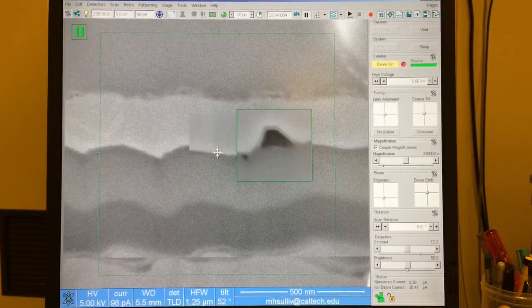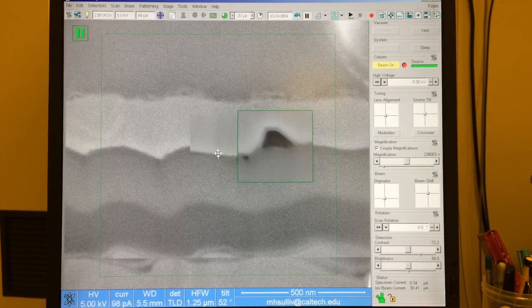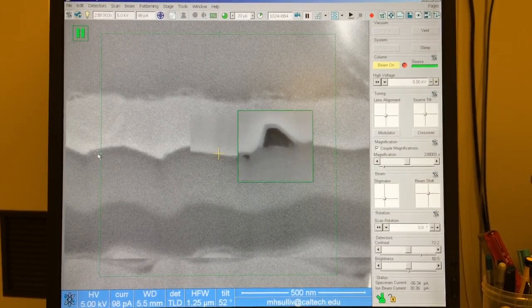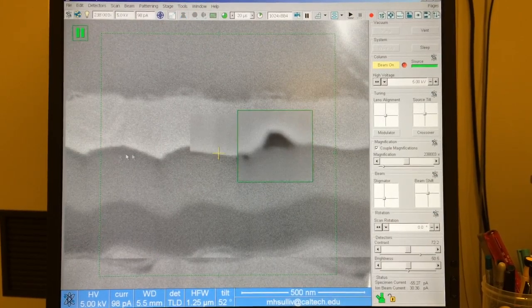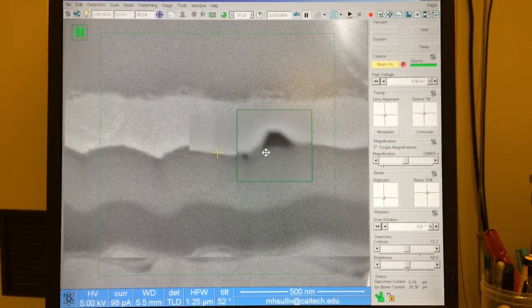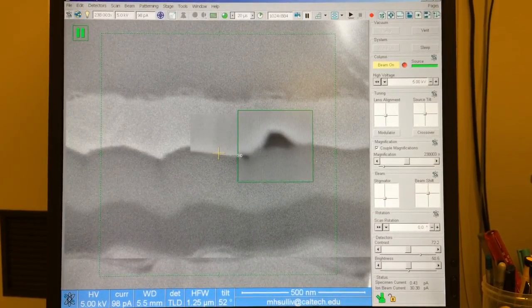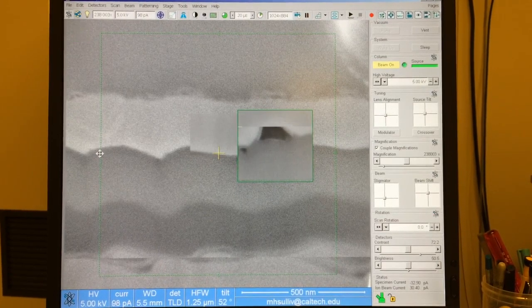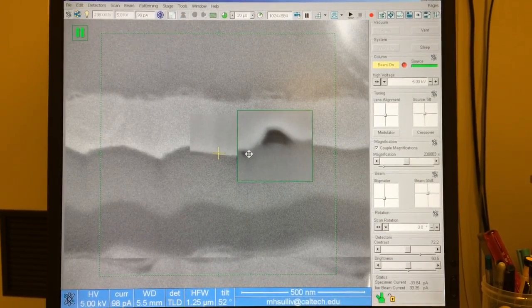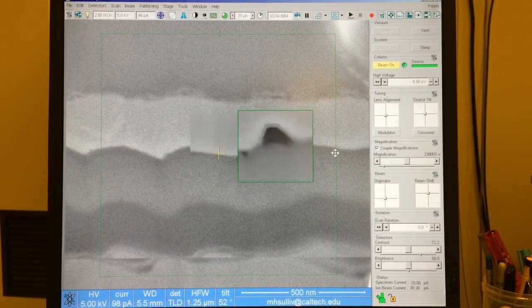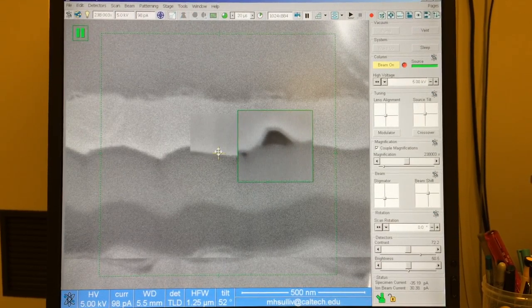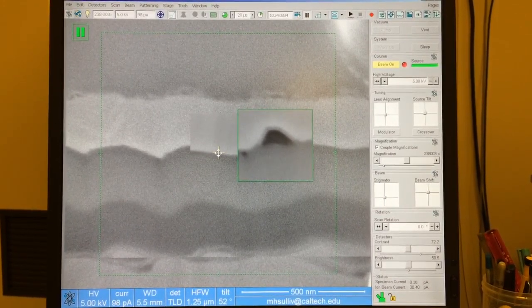Now we can repeat the same process with the x-astigmatism. I use shift and right-click to get a four-way arrow, then release the shift key. I'll compare the right side to the left side — and you can see it was much better on the right. So if it's much better, I'll move the mouse an appreciable distance to the right of the center cross, making an adjustment of a couple of inches, then iterate the process again. Comparing right to the left — still a little better on the right — we repeat again, comparing right to left. Now those look about the same. So if they're about the same, you go back to center, and we're done with our x-astigmatism.